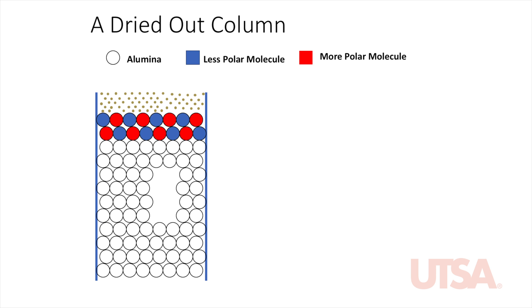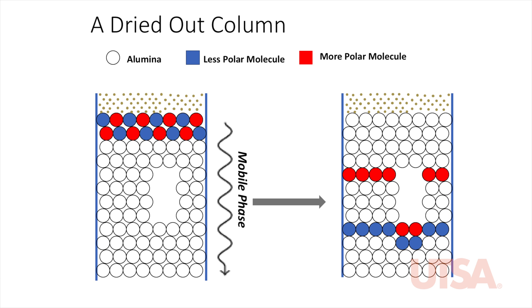Another problem to avoid is a dried out column. If the column dries, it will crack, and the gaps will cause the molecules to run through the column in an undesirable fashion. Do not let the column dry.